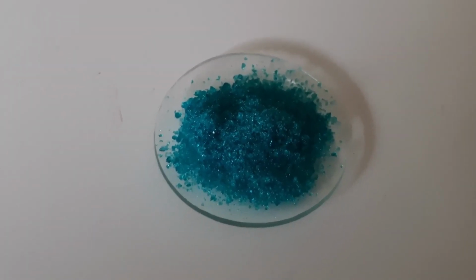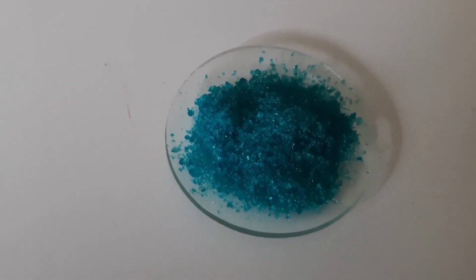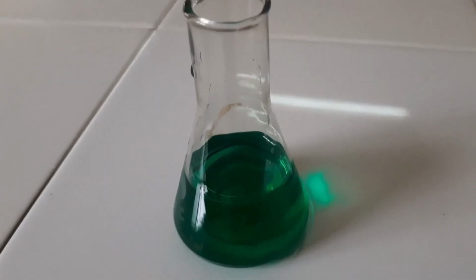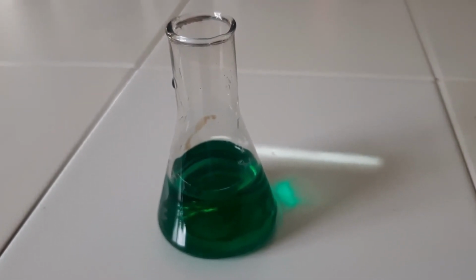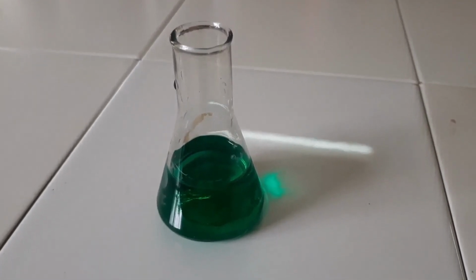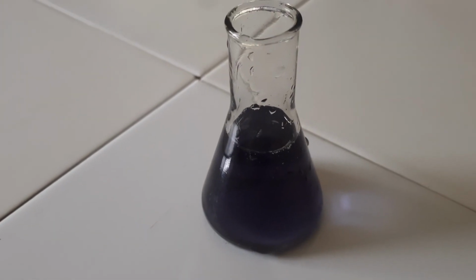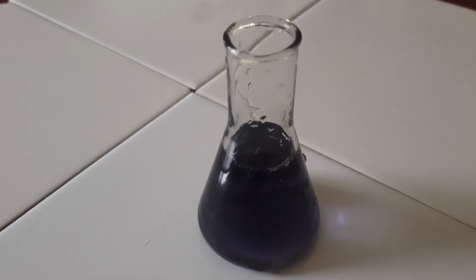Now you see green color solid nickel sulfate. After dissolving this solid, it is possible to make a solution like this. It is green in color. This solution contains Ni2+ ions. So a Ni2+ ion solution is green in color. Now you can see a solution of Cr3+ ions. It is violet in color.